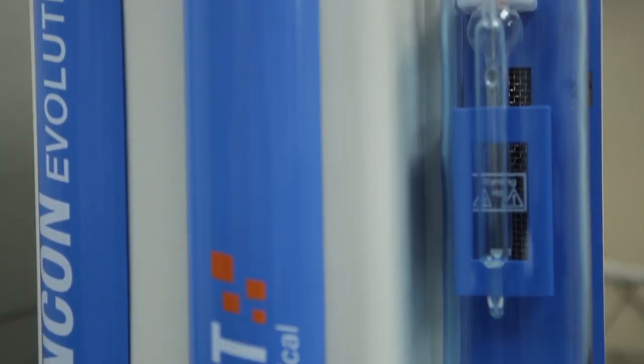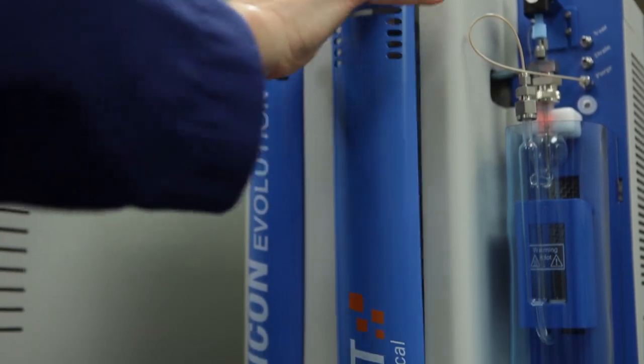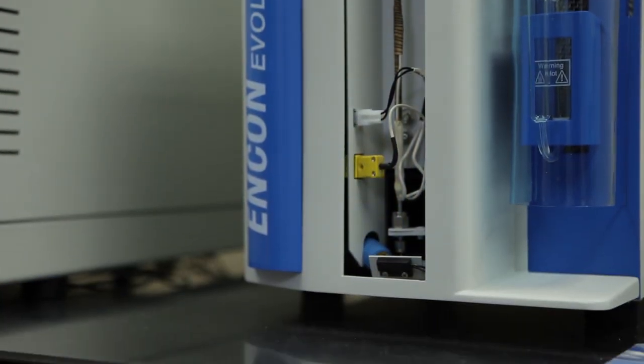Access to the moisture and analytical trap are quick and easy. Either can be removed in seconds once the cover has been opened.